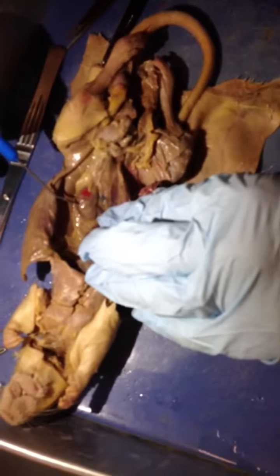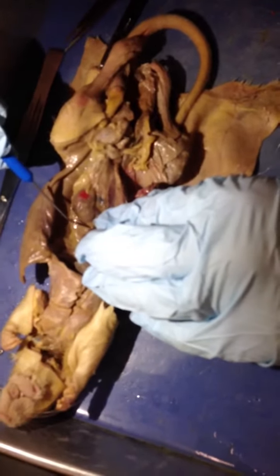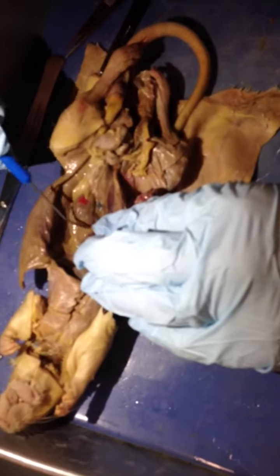Okay, this is the spleen right here. This is your kidney. This right above it is the adrenal gland, usually covered with a lot of fat, but that's your adrenal gland.